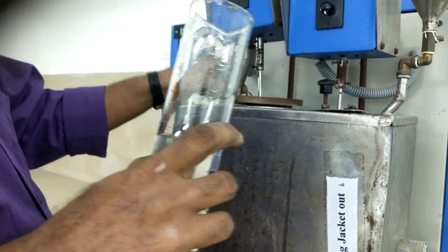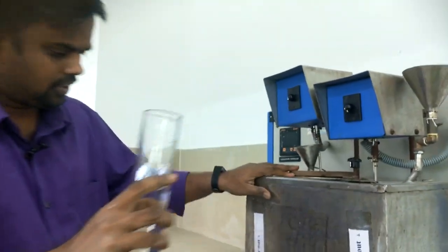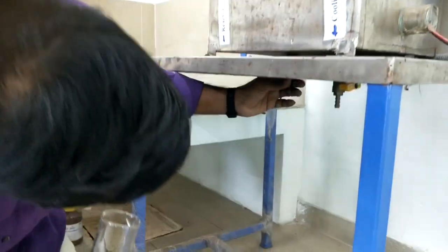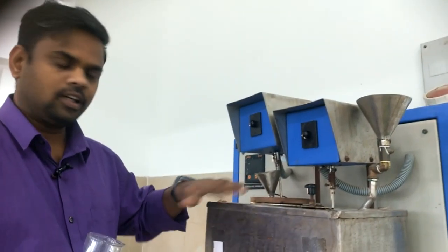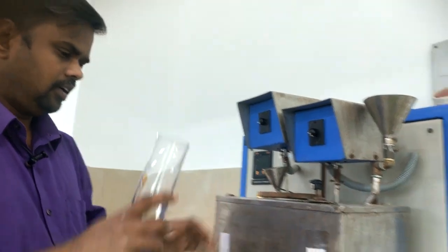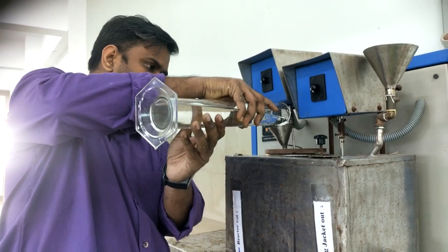Hold on, it's just a little. Before that, there is a valve at the bottom, we have to close it. First we rinsed with water and cleaned the batch reactor. Now we are filling it with reactant A, ethyl acetate.